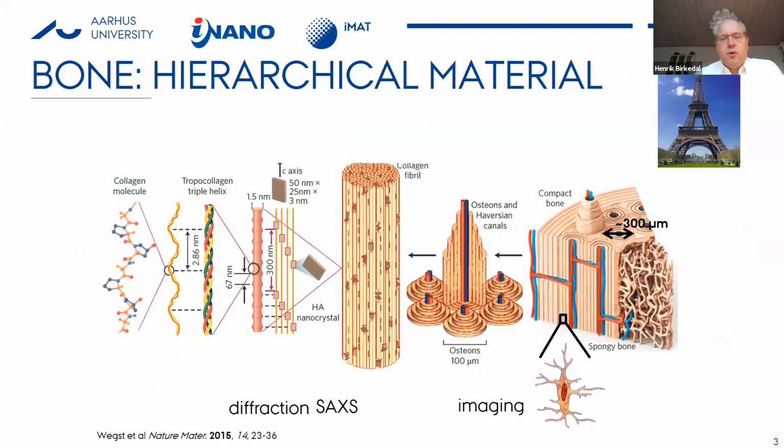So we've seen this before in both Peter's presentations and also by Tillman. Bone has this very complex structure, and as remarked upon by Peter, there is this intriguing cellular network formed by the osteocytes that we would like to understand better, because most of the biological knowledge we have about it actually comes from cell culture and less from what actually happens inside the actual bone. And since it's structured across many length scales, there's a complication in actually doing this in practice.